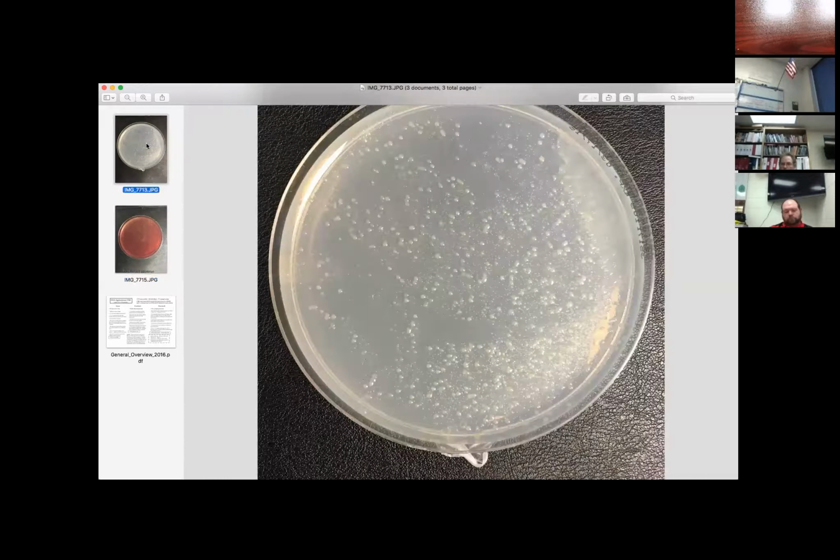So to count these bacteria, Carolina recommends that the students, when you're preparing, pick up the Petri dish and on the bottom of it take a permanent marker and actually mark a little dot or an X somehow over each bacteria colony. That might be wonderful when you're practicing in your classroom, but with the amount of contestants, we can't have the students do that the actual day of the event.